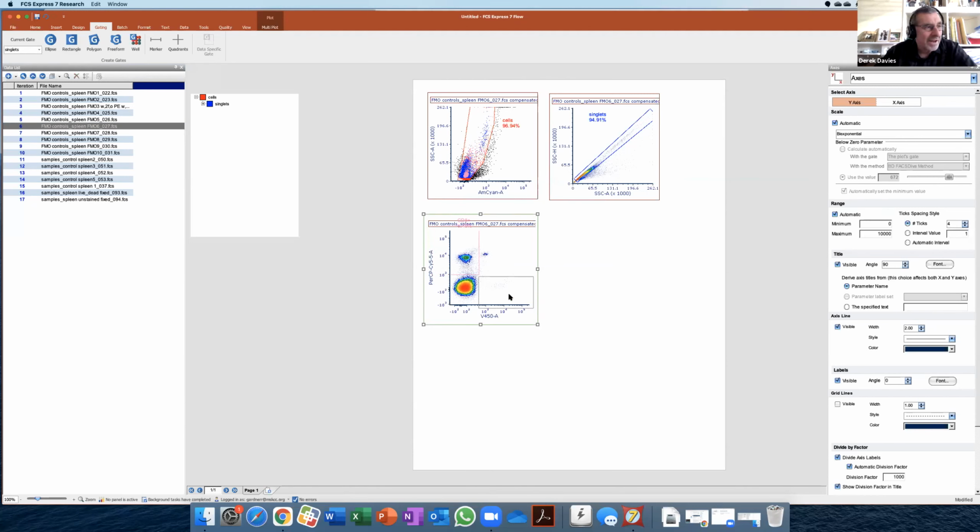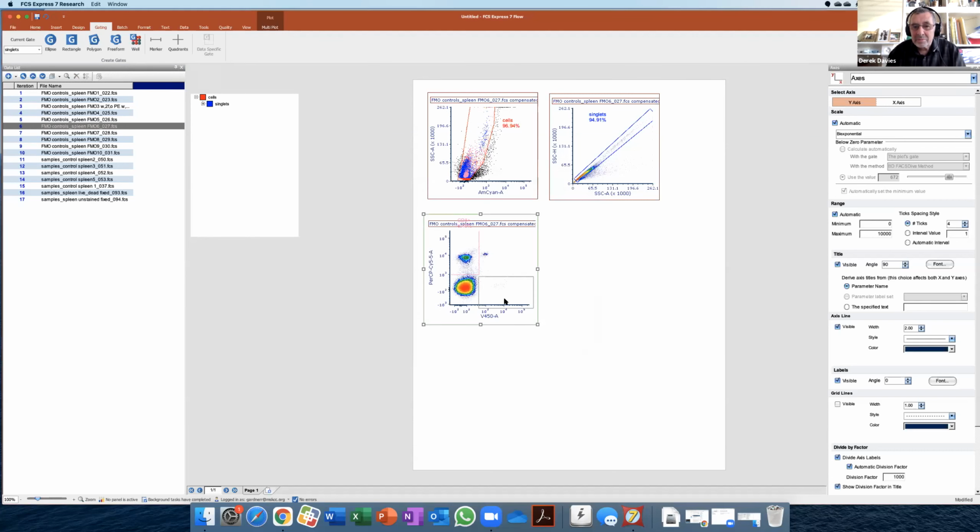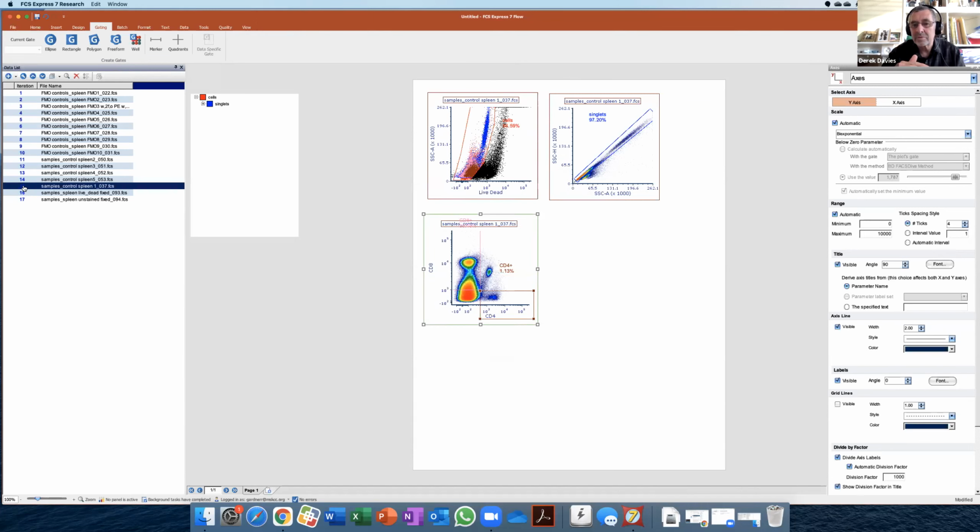So I'm back again, Rui. Yeah, go ahead. I think one of the things that, particularly when you first start off, we like to think of flow cytometry as this fantastic, almost completely objective technique. But even though we have an FMO, which is the right control for setting that cutoff, the question that I would get asked is, why have you set it there? Why haven't you set it 2 or 3 pixels higher or 2 or 3 pixels lower? Mm-hmm. So there's still a little bit of subjectivity in there, isn't there?